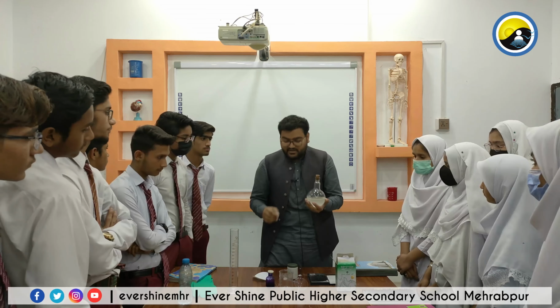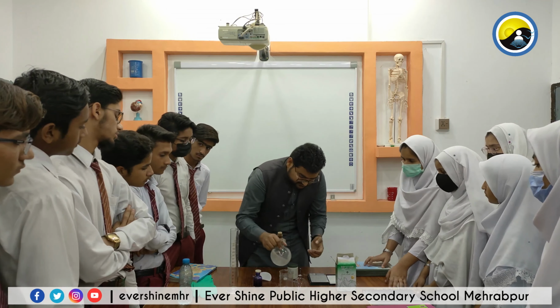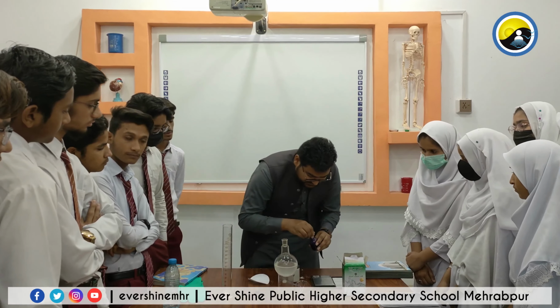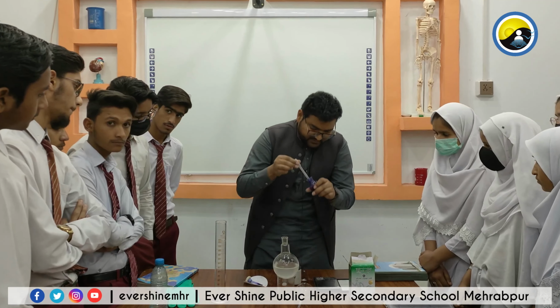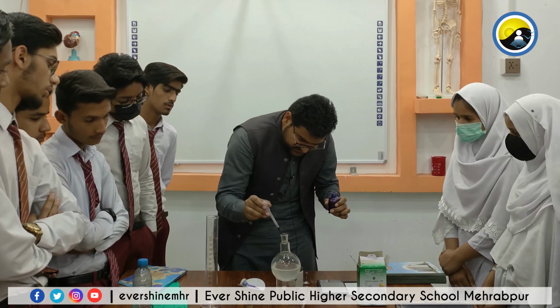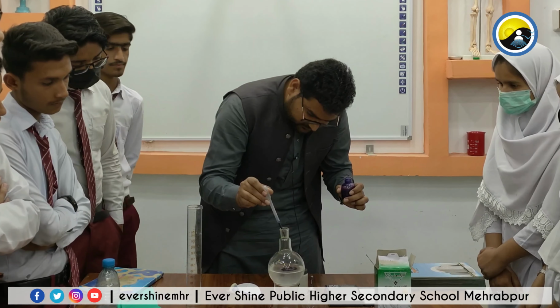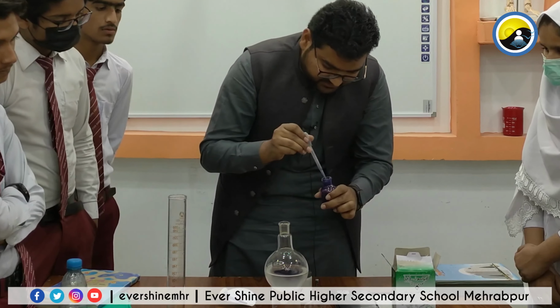For this reaction we will use methylene blue. So, I will add 5 to 7 drops of methylene blue. The concentration of methylene blue is 1%. With the help of a dropper, I will add 5 to 7 drops. Okay, I have added it.